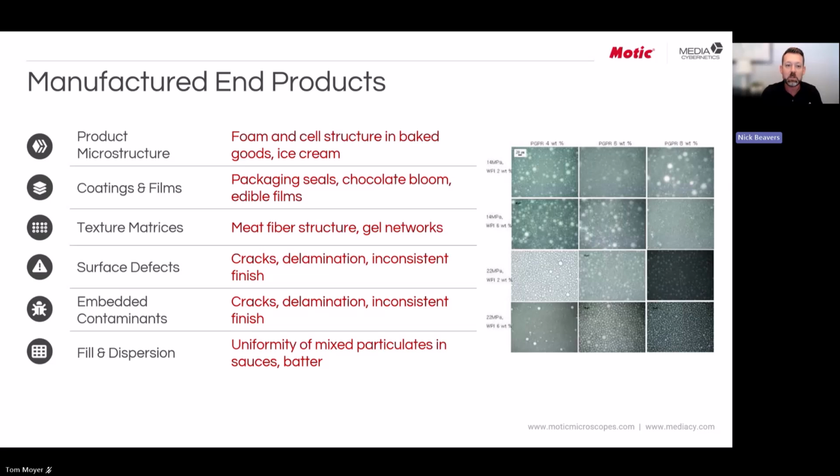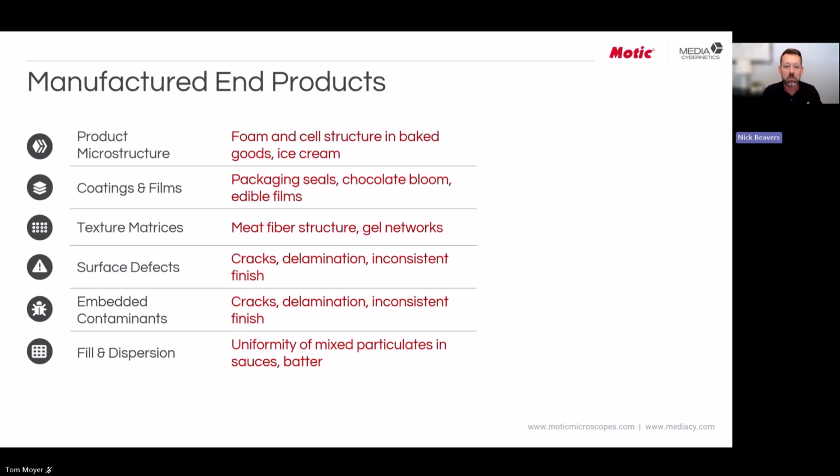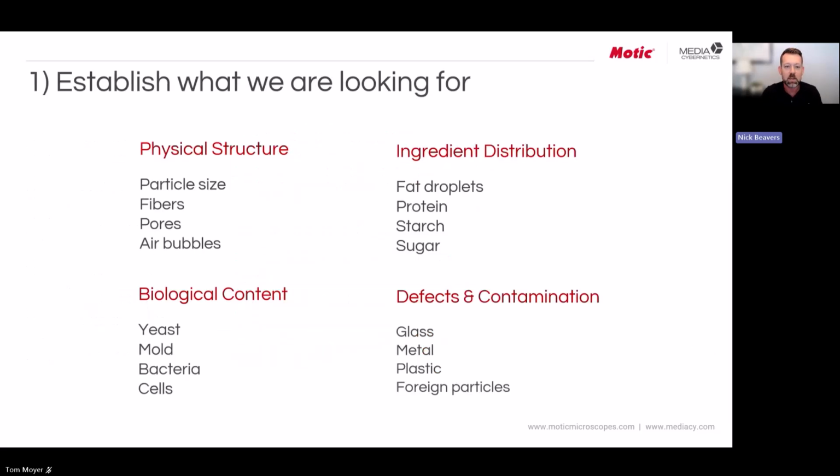And on the next slide, I want to talk about really what is the first step. So step one is going to be understanding, based upon all these different types of materials and ingredients you may be working with, what is my end goal?